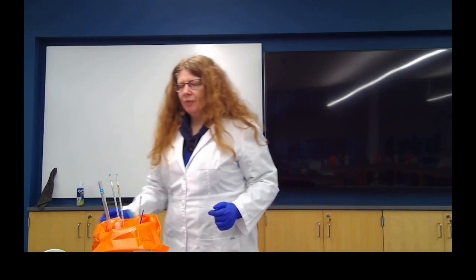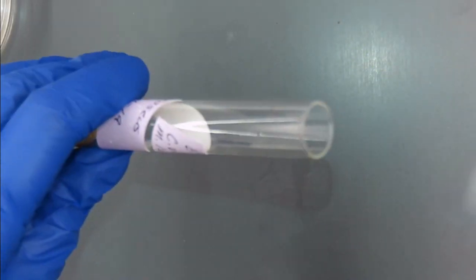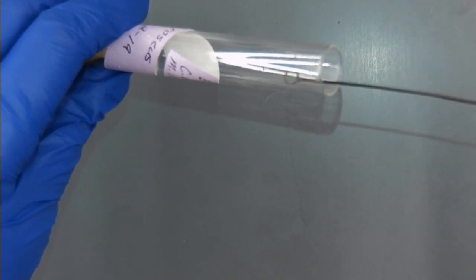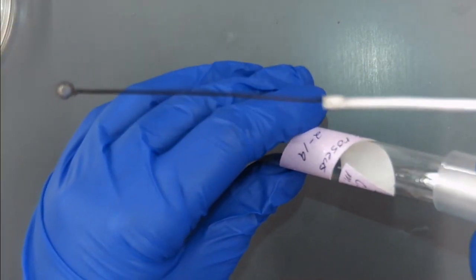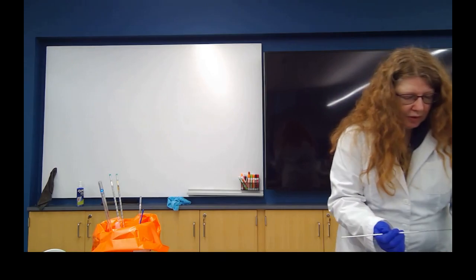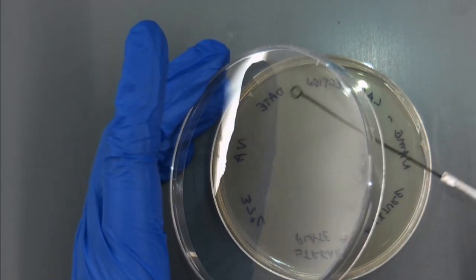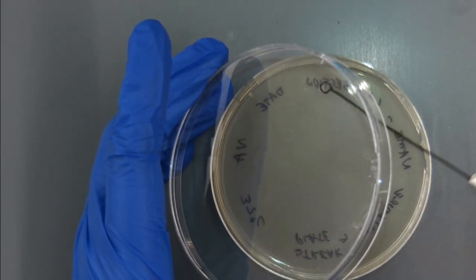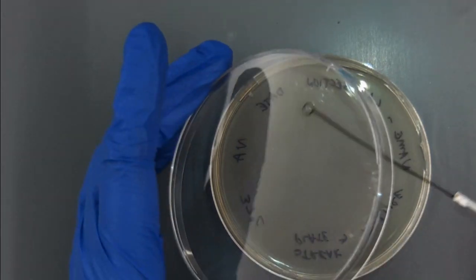Now we're going to take our loop that has already been sterilized because we've used it before. Remove the cap with our pinky, move the tube to pick up a loop full of culture, and recap the tube. Now we're going to take our loop and spread it gently on one part of the plate, back and forth. Notice I'm doing it gently and not digging into the agar, using the lid as a shield.